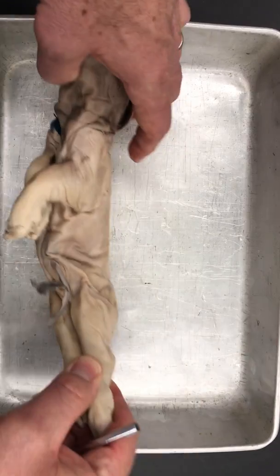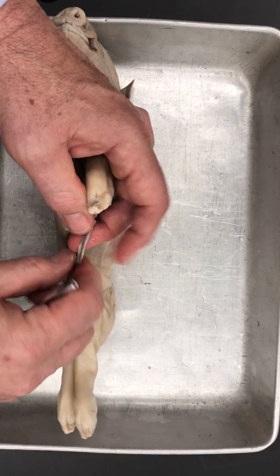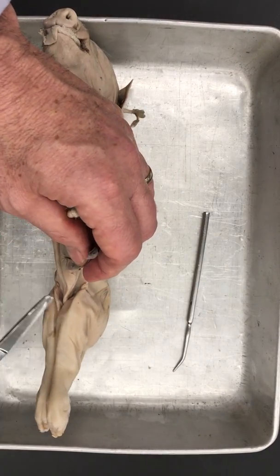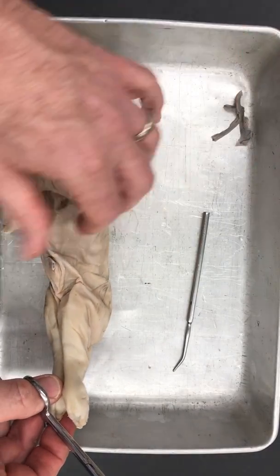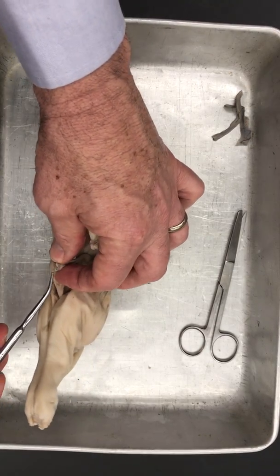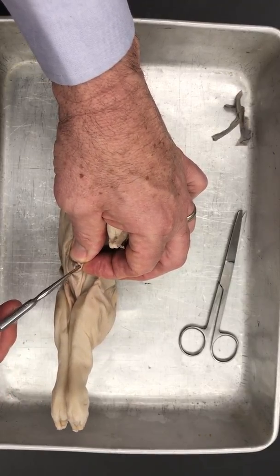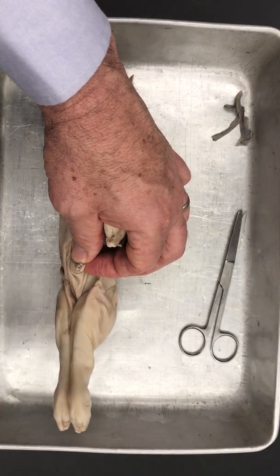And then we have an umbilical cord. You and I had an umbilical cord. This guy's umbilical cord is not in that great a shape. So I'm actually going to cut this a little bit close to the pig. Any material that you have left over, set to the side, and eventually you're going to get rid of it. This is maybe not the best one here, but there are 3 blood vessels in there. You can't see them very well on this one. I'll show you in a different pig in just a second. So this is the umbilical vein, and then next to it there are 2 little arteries. You can't see those really well right there, but that's where they're at.